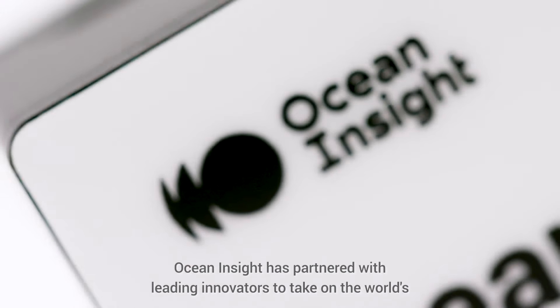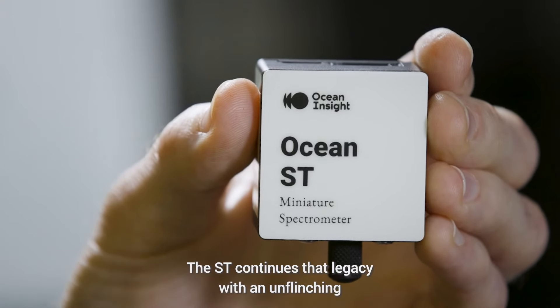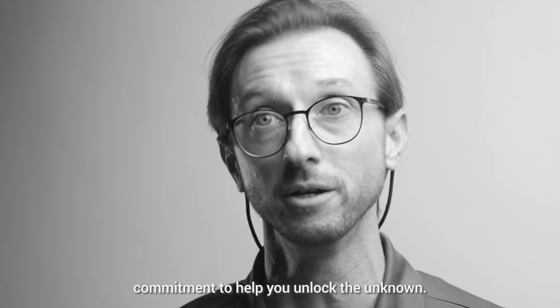For more than 30 years, OceanInsight has partnered with leading innovators to take on the world's biggest challenges using modular spectroscopy. The ST continues that legacy with an unflinching commitment to help you unlock the unknown.